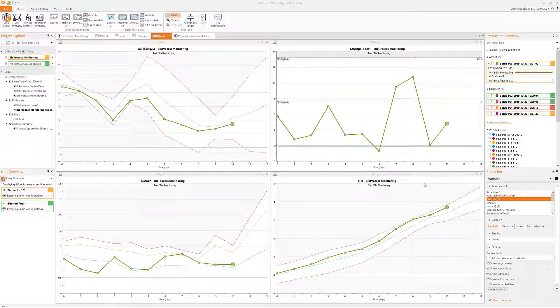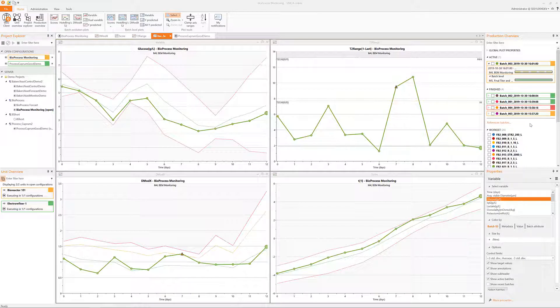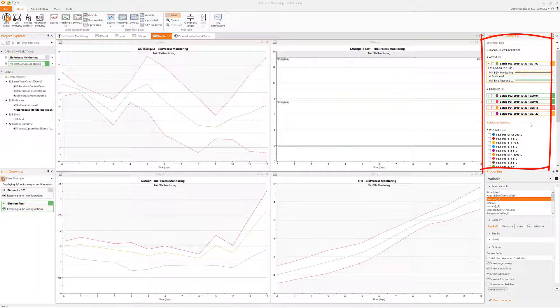I have now logged in into the client and opened the bioprocess monitoring example that can be found in the demonstration projects included in the installer.